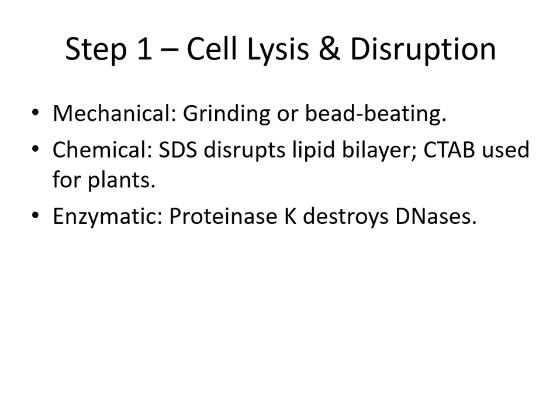Besides that, in the case of prokaryotes, we can extract DNA with enzymatic hydrolysis, in which we can use enzymes which will be able to destroy the unwanted cell wall of prokaryotes.